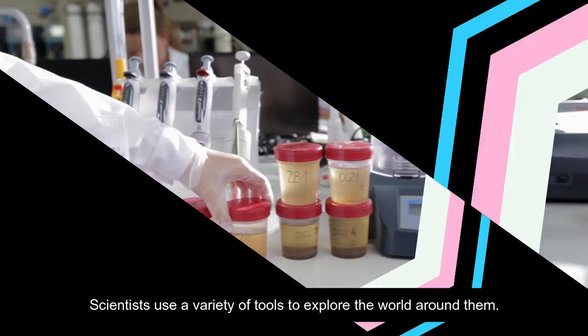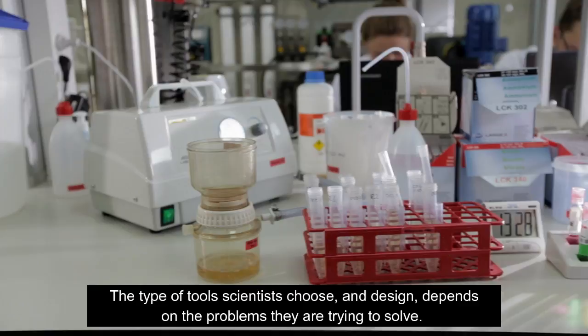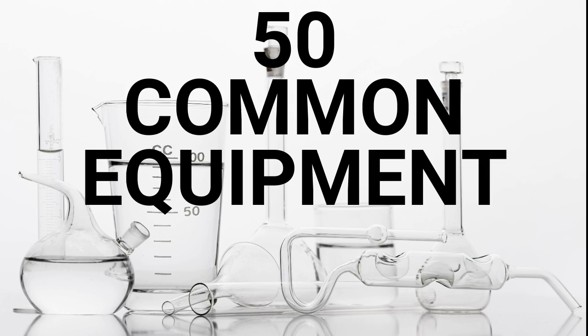Scientists use a variety of tools to explore the world around them. Tools are very important in the advancement of science. The type of tool scientists choose and design depends on the problems they are trying to solve. This video looks at 50 common equipment used in science labs. They have been ordered alphabetically.